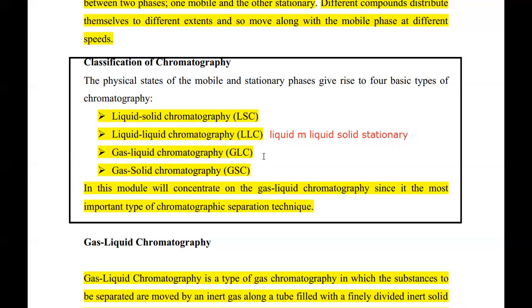What that means in here is that we need to have a moisturized environment along the column. I'm going to explain the column. Inside of the column has to be moisturized, of course, by some special solvent. That is the liquid.